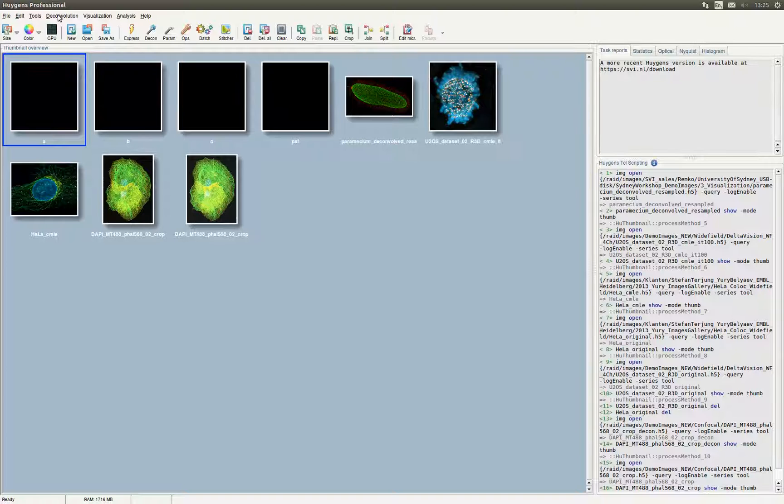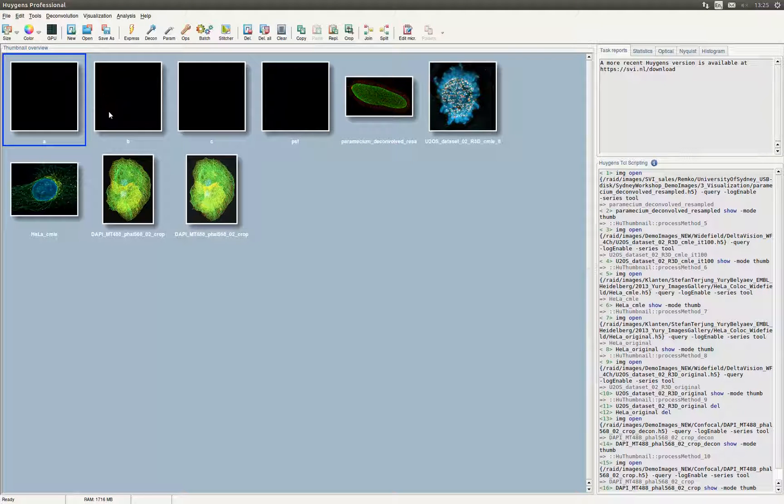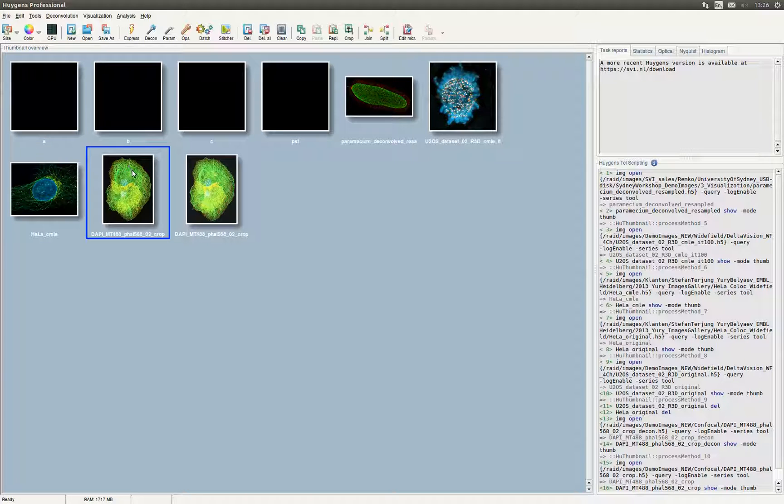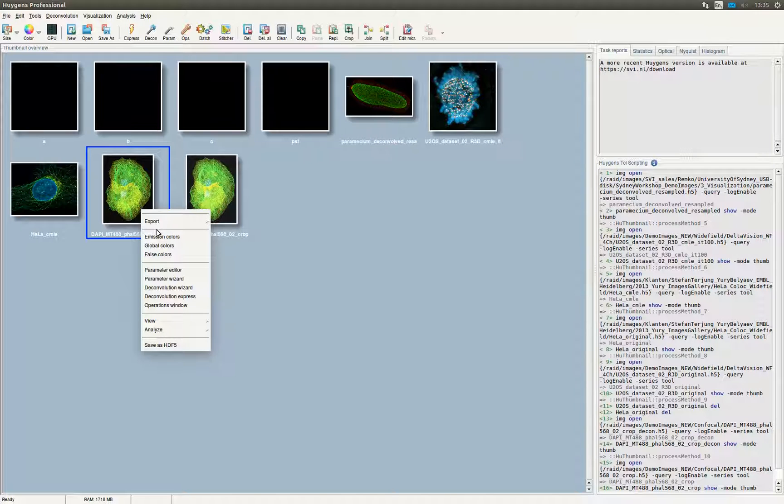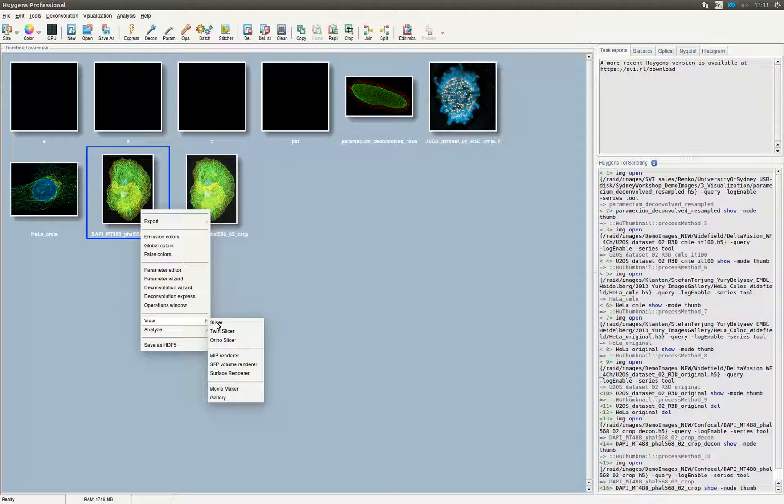In the Huygens software, in this case Professional, we have already opened a couple of images. First we are going to take a look at the TwinSlicer tool. The TwinSlicer allows you to synchronize views of two images, measure distances, plot line profiles and more. After you select the image you want to view, we right-click the images, and under view, click the TwinSlicer.